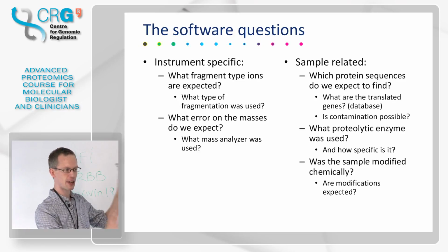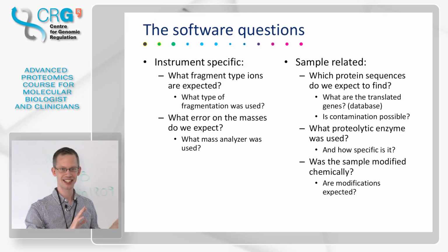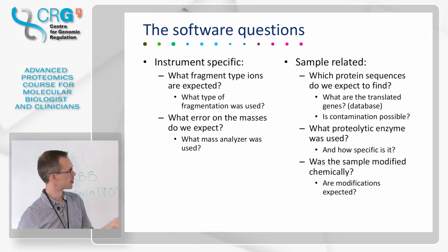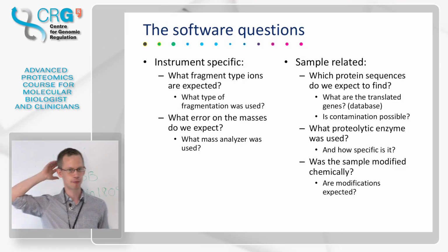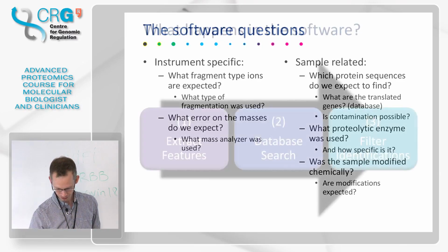So this is just some very basic questions on what the software settings are, and how they affect the sample and the instrument. You should think a bit about this and have these in the back of your mind. So keep this slide. It's good to come back to once you, because you tend to forget these things.